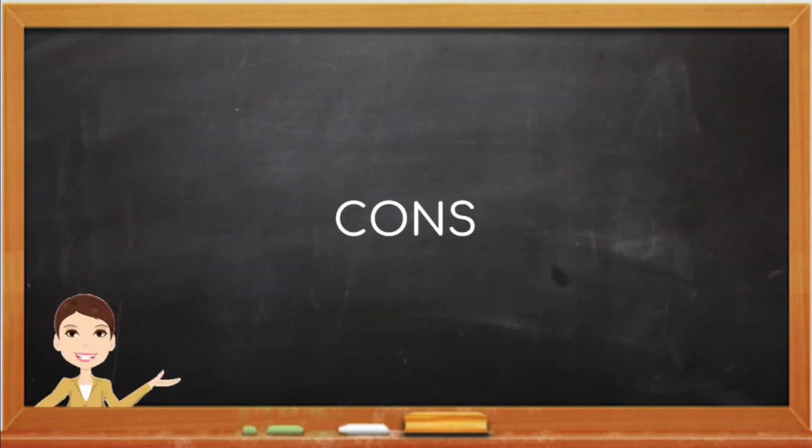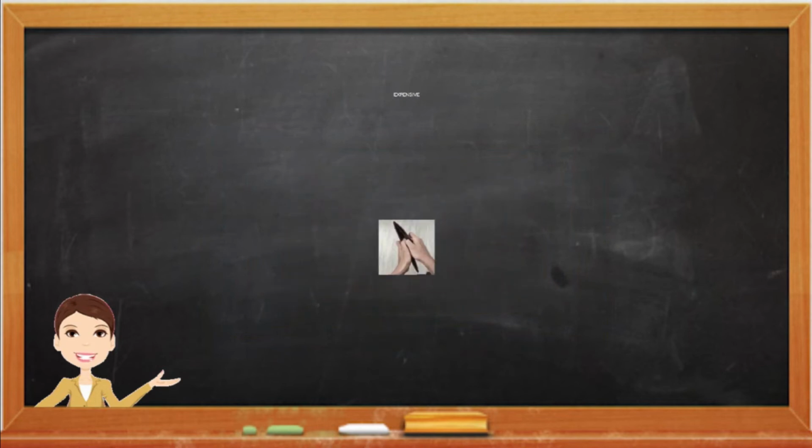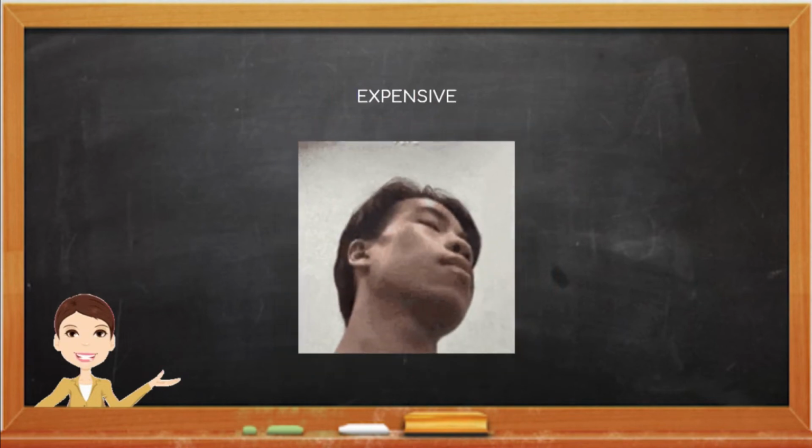Cons of ChIP sequencing. It's time-consuming. Antibody development and quality affects the success rate of ChIP sequencing, but testing every antibody takes time. It's also expensive. ChIP sequencing requires a lot of tissue, which might be an issue if using rare sample types.